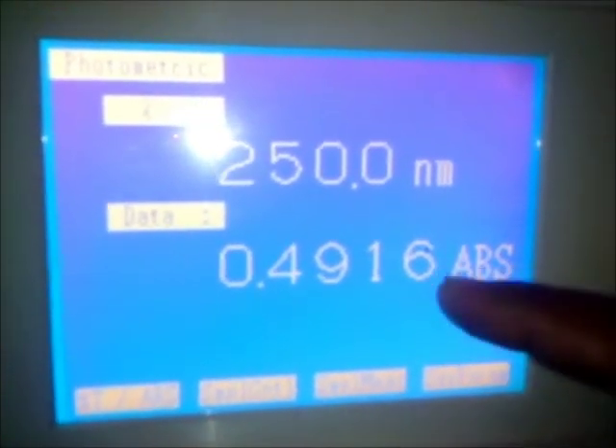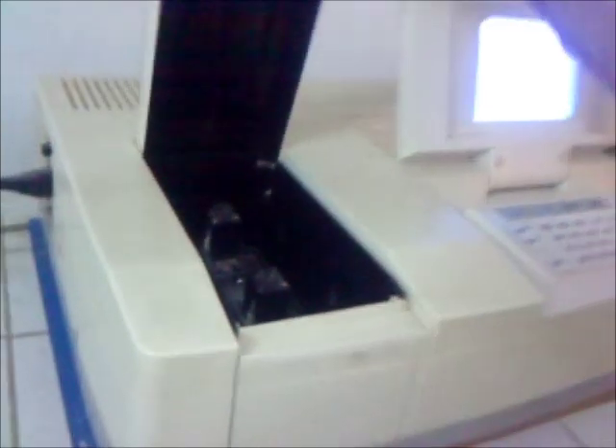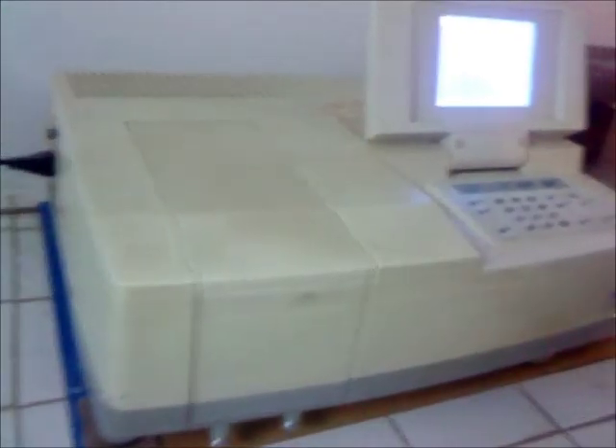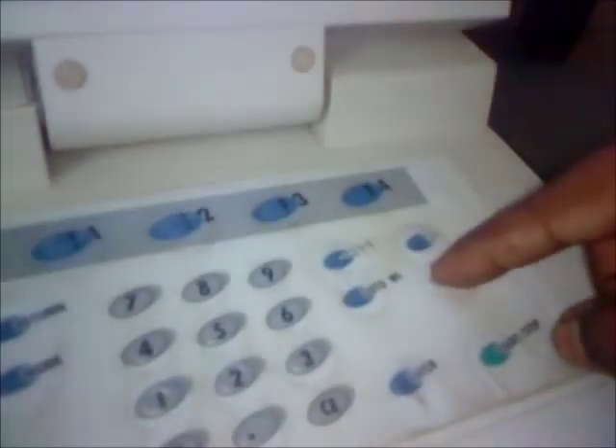The absorbance is 0.4916. We take the blank — water as a blank — and keep it in the cuvette holder. Then we close the cuvette box, after which we enter the auto-zero to set the absorbance reading to zero.